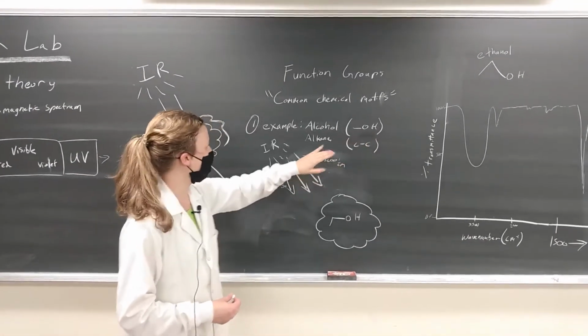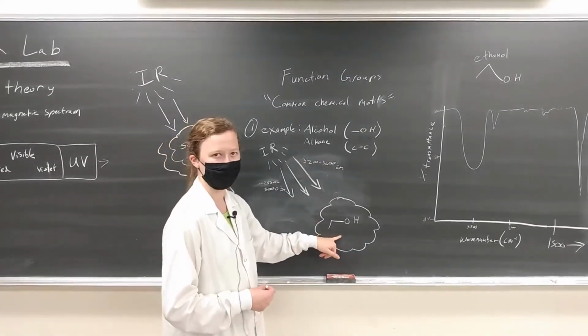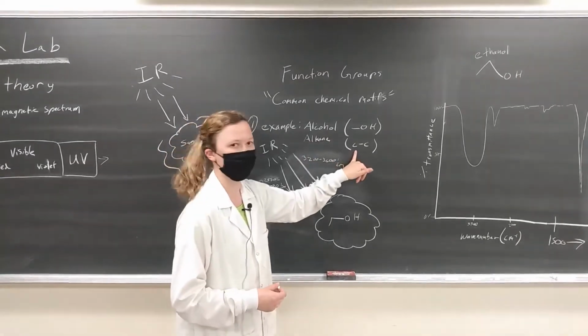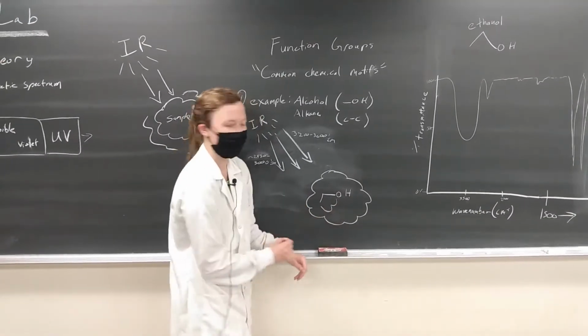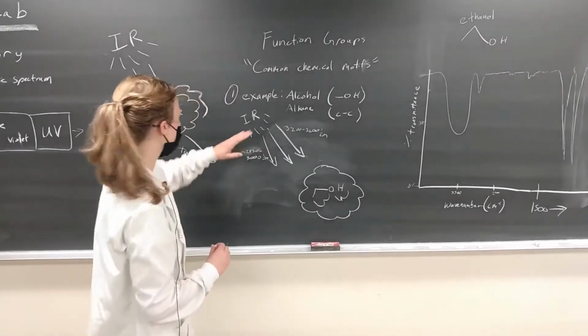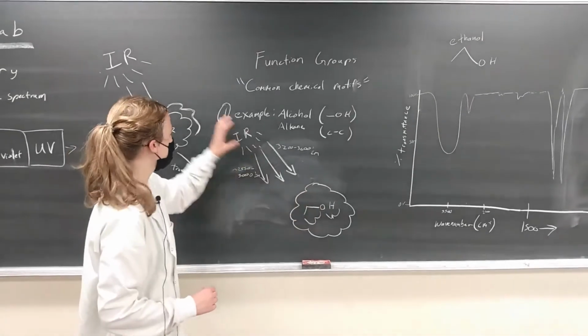Okay, so an alcohol OH group, and we also are going to have an alkane on this molecule. For an example, we're going to use ethanol down here. So in addition to alcohol, it has an alkane, which is just a single bond between carbon atoms. So the alkane on this molecule is going to be this section down here, and the alcohol, OH, is right there.